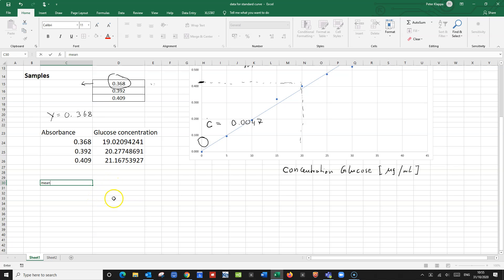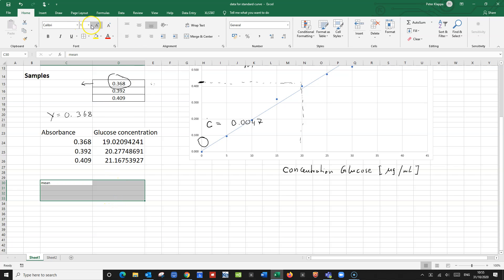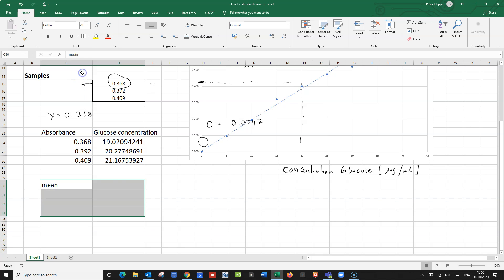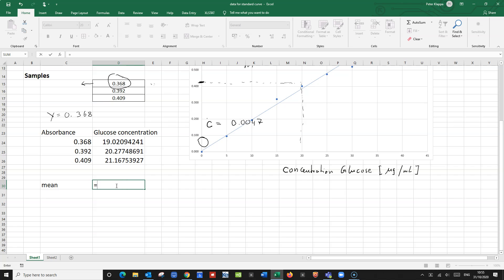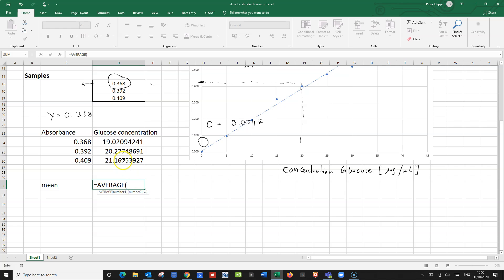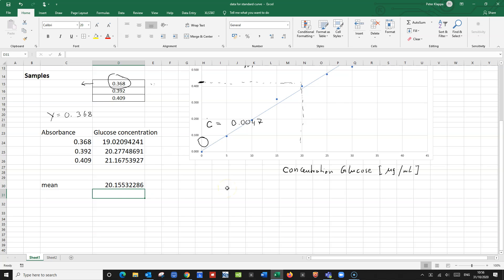Let's make this a little bit bigger so we can see it clearly. We can calculate the mean — in Excel it's simply AVERAGE. All we need to do is highlight the numbers and don't forget to close the bracket. And we get a mean of 20.15.